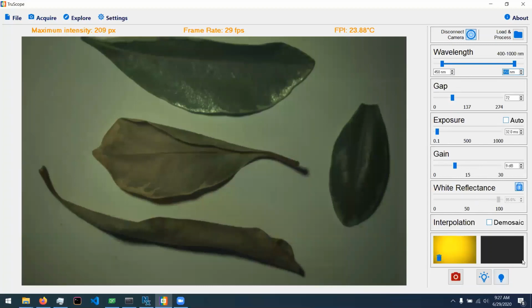A white calibration can and should be performed prior to capture of the image once the gain has been changed and set. If there are existing black and white data cubes, their images appear here.